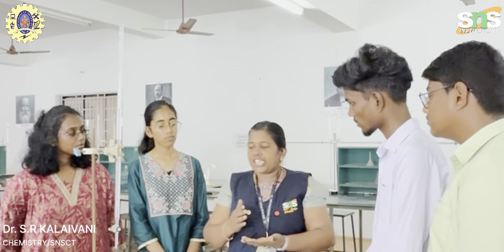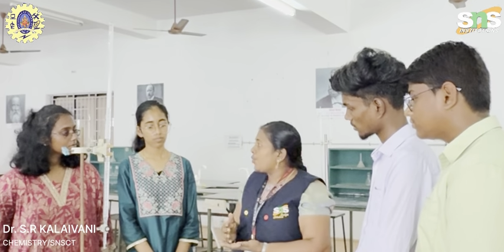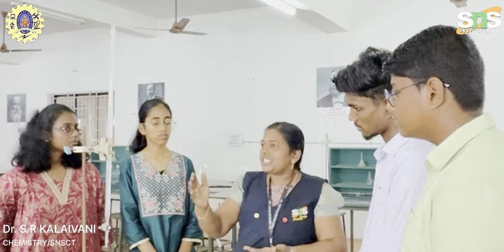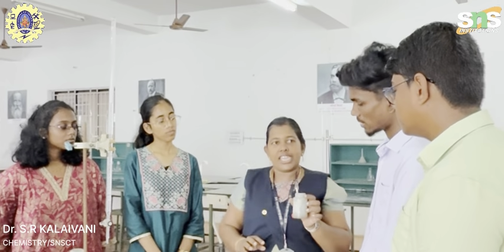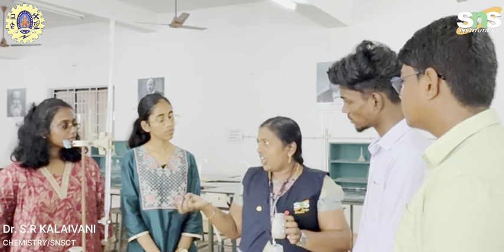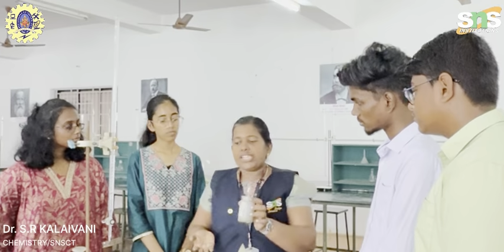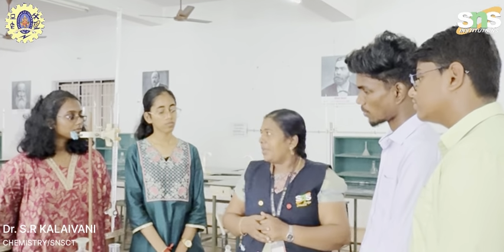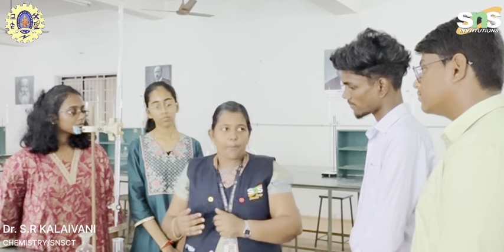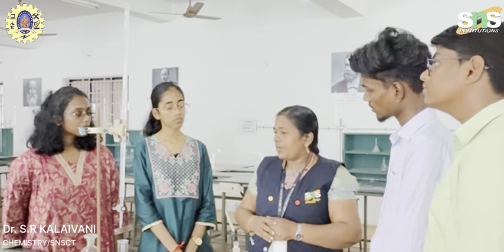The abbreviation EDTA stands for ethylene diamine tetra acetic acid. The abbreviation EBT stands for Eriochrome Black T indicator. This is a metal ion indicator. We know phenolphthalein and methyl orange are examples of acid base indicators, but EBT is a metal ion indicator. This titration is a complexometric titration because of the formation of a complex, the calcium magnesium EDTA complex. So this is a complexometric titration.